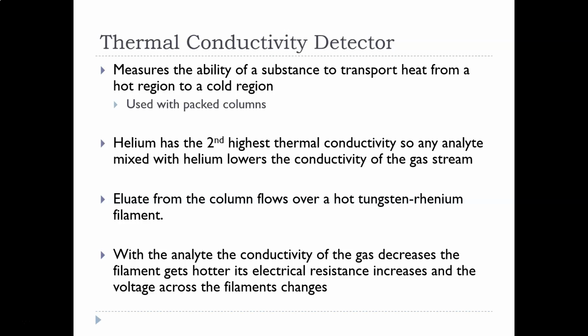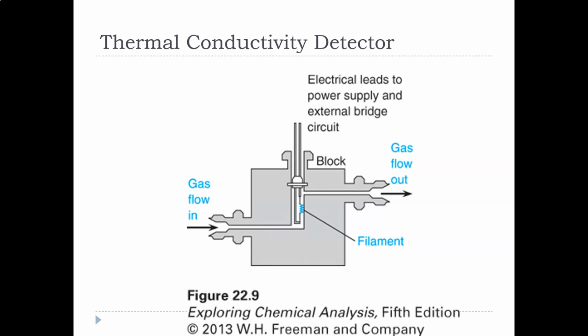It would be unique to the analyte, and this is what it looks like. There's no fire. The gas goes in and it makes a measurement right here. This is where that thermal conductivity is measured, and then the gas leaves. What happens up here with the wires is where it takes that data and deals with it. So thermal conductivity works for everything.